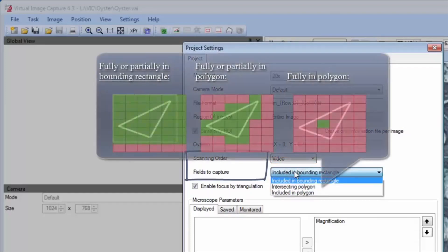The fields to capture option allows capture of images having a portion that lie within a bounding rectangle, or within a bounding polygon, or only those images which lie wholly within a bounding polygon.